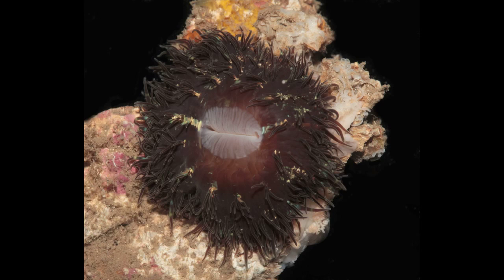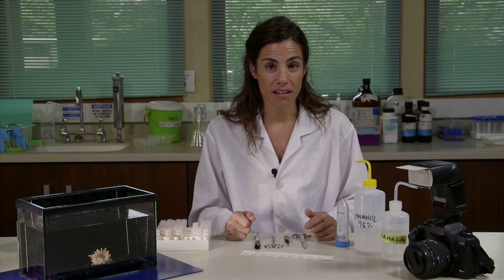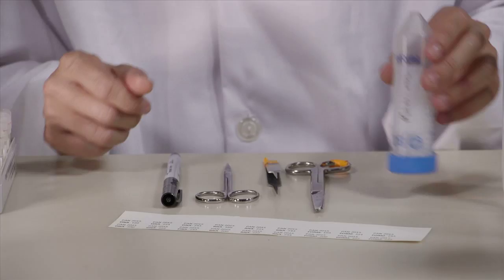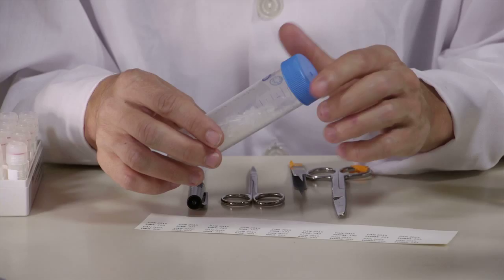Once you have recorded and photographed the anemone, you should relax it. To relax sea anemones, they should be in a small aquarium or other container and air should be provided. A very easy way to relax sea anemones is using menthol crystals, although magnesium chloride can also be used.